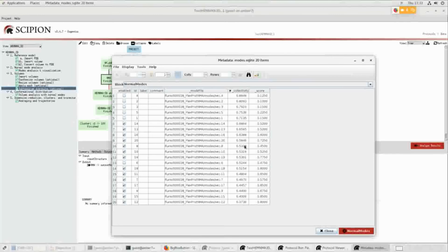It's something that you need to check, to see those modes that are above the threshold. First you say, okay, in this case, above 0.5 should be fine. So globally, I should have a number of modes that I should in principle take.